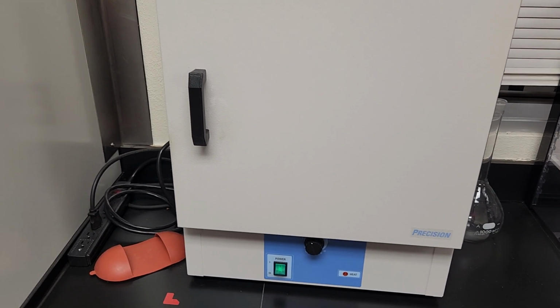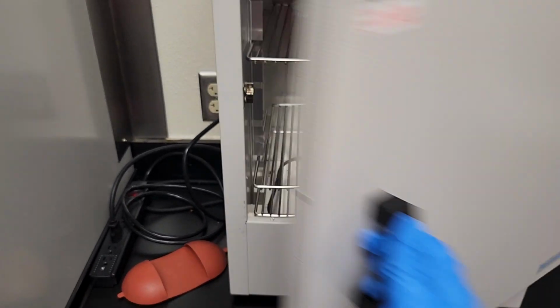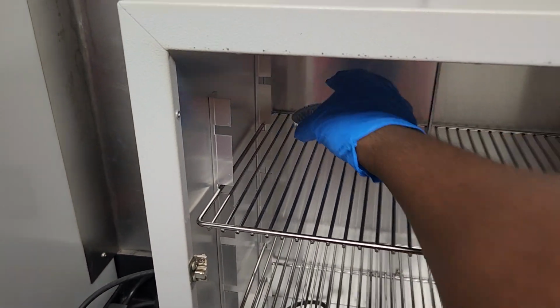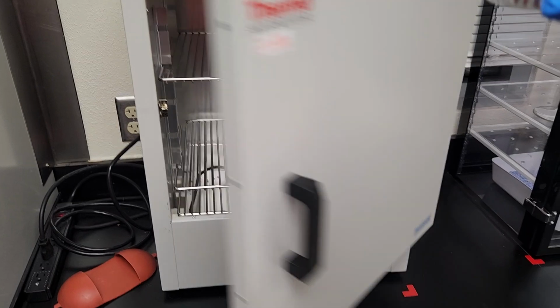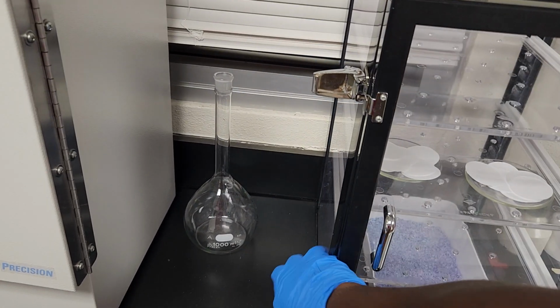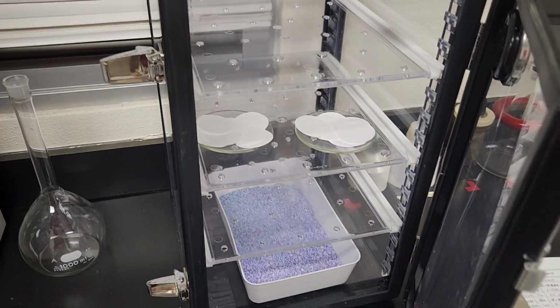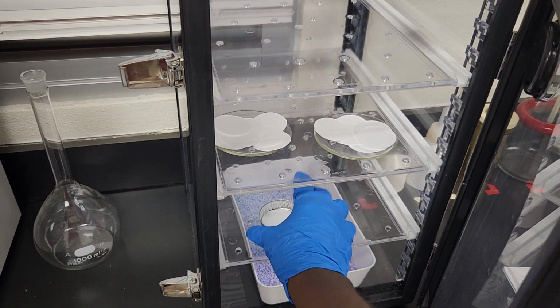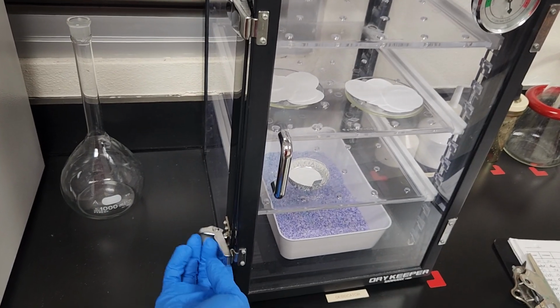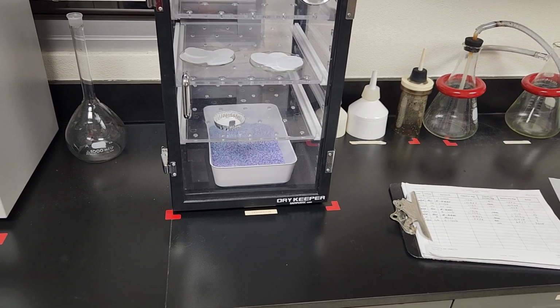So after a period of time that the sample has been in the oven, it's time to bring it out. Bring out the oven sample. And we're going to put it in the desiccator depending on your facility requirement. Sometimes some people leave it for 15 minutes, 20 minutes. We just need to find out that. We'll leave this in here. Now we'll come back and measure and weigh it.